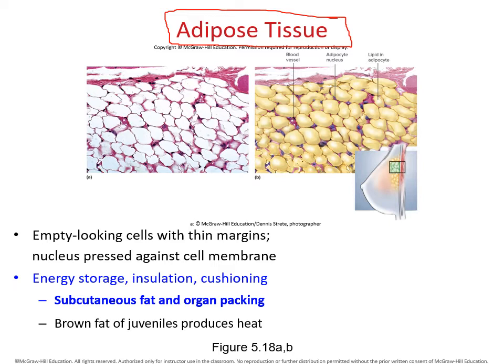Now, take a look at your illustration, and I want you to look at your little adipocytes, your individual cells, and if you were to describe them, I think many of us would say they look like a circular structure. And it turns out that the adipocyte is actually the outline of the circular structure. This on the inside, this is its lumen. This is its storage unit.